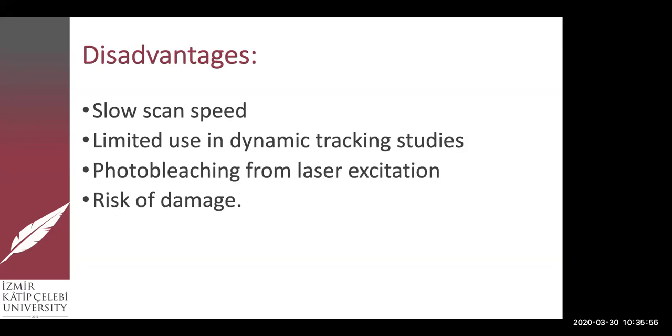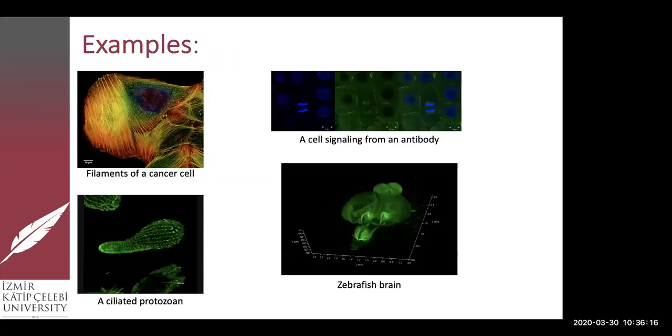Some disadvantages: the scanning speed is really low, and it is also limited for use in dynamic tracking studies. Photobleaching may also occur from the laser excitation, and there is risk of damage after the laser exposure.